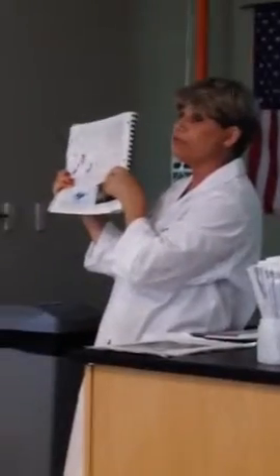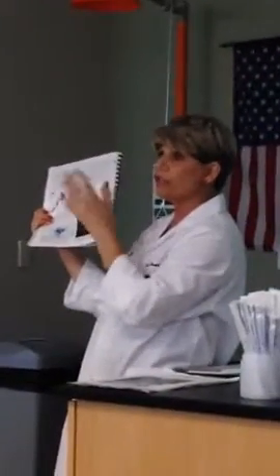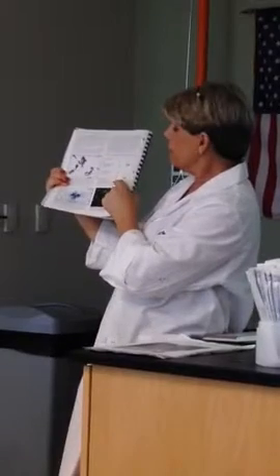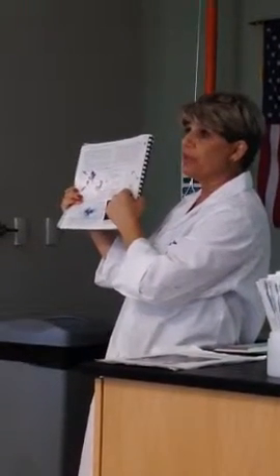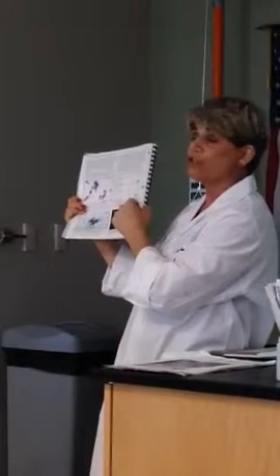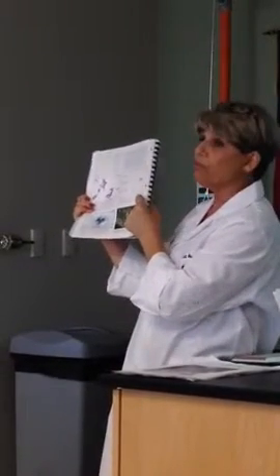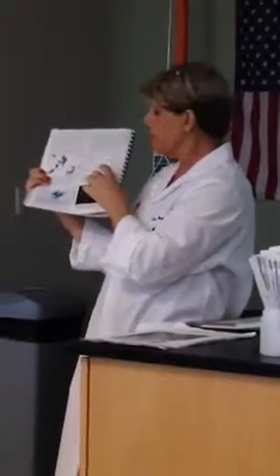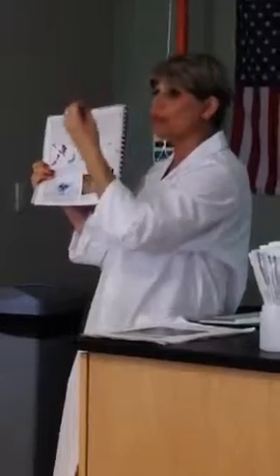If I took my slide and put it on a microscope now, I'd see the pink ones, but I wouldn't see the clear ones. And I want to see the clear ones just to be sure that I didn't wash them down the drain. So I go back with a counter stain of a different color. Even if I add green to this pink, the pink is already in the waxes and the green won't change that. But the clear cells are going to pick up the green and turn green. So non-acid fast cells are going to end up being green because of this counter stain. Your acid fast cells are going to be pink because they retain the primary stain throughout the process.